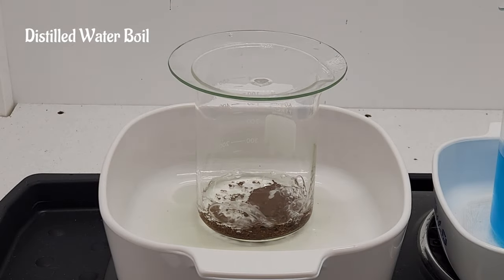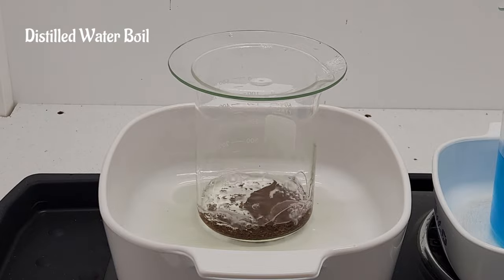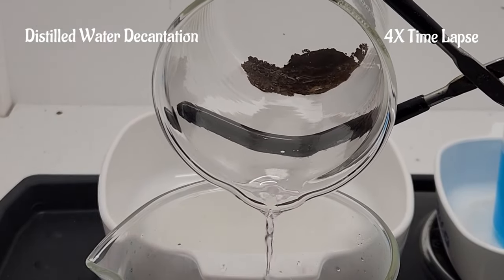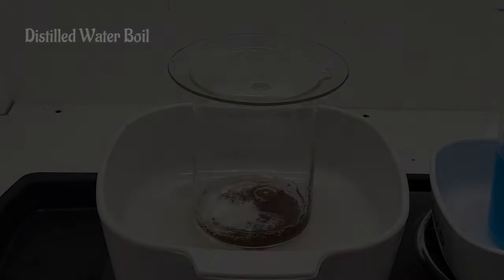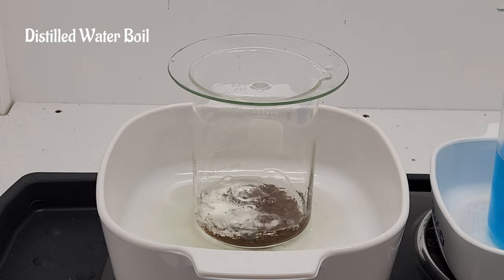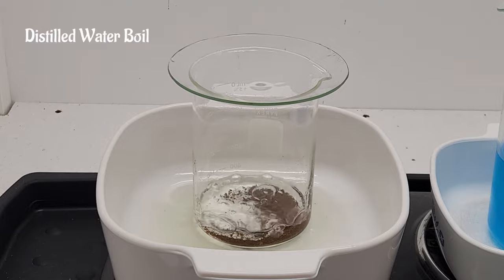After allowing our gold to settle at the bottom of our beaker overnight, we decant our solution into a separate container, allowing for any gold loss to be recovered at a later time, and perform several distilled water rinses. A hydrochloric acid rinse further helps in the removal of impurities. These rinses should also be decanted into this container.